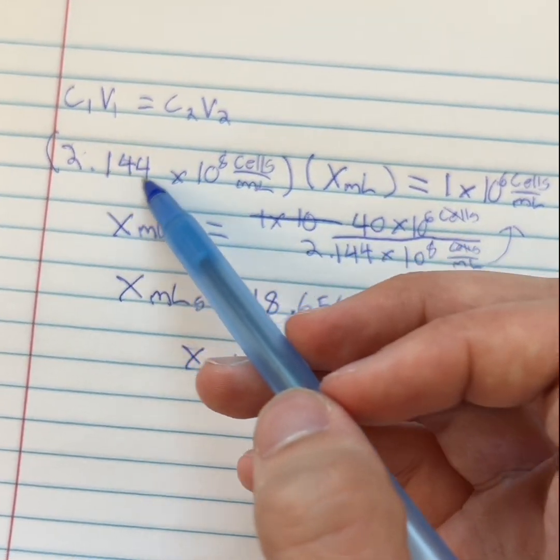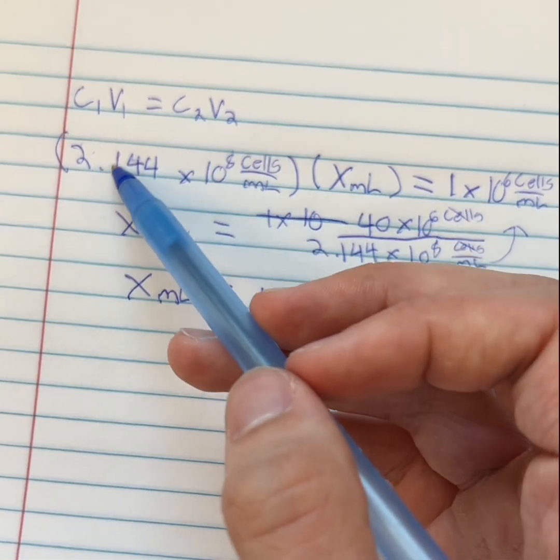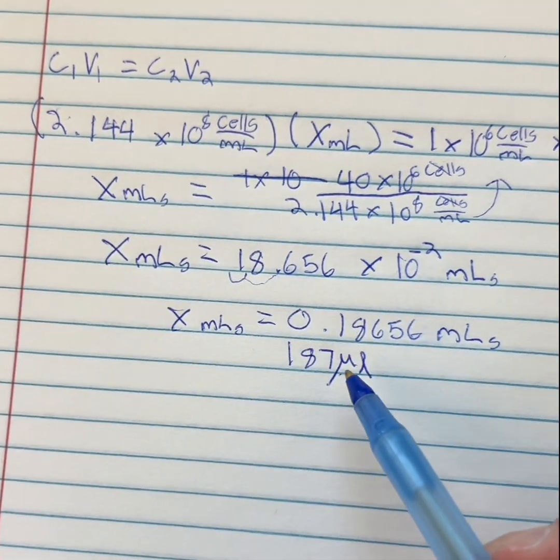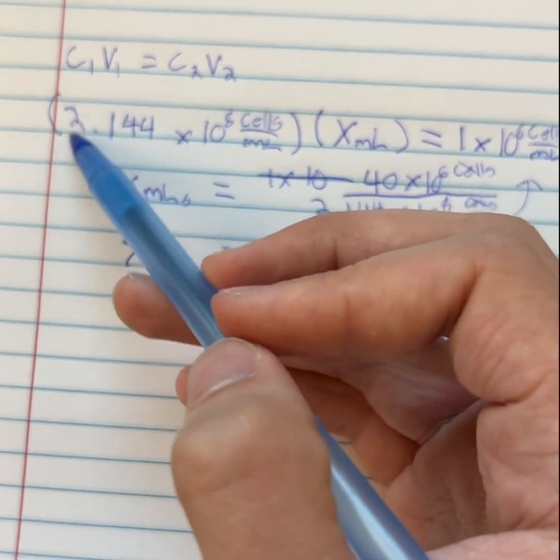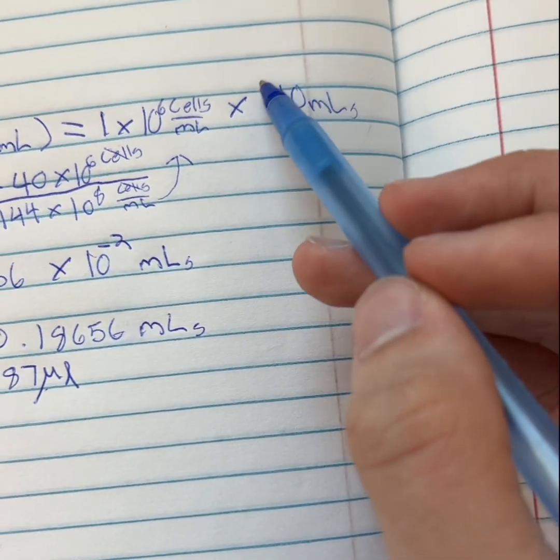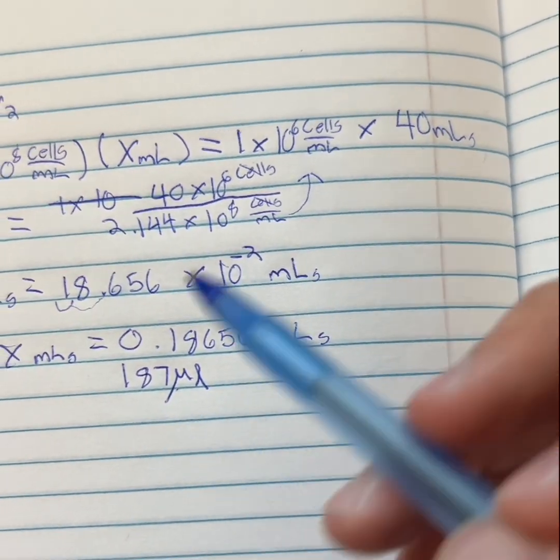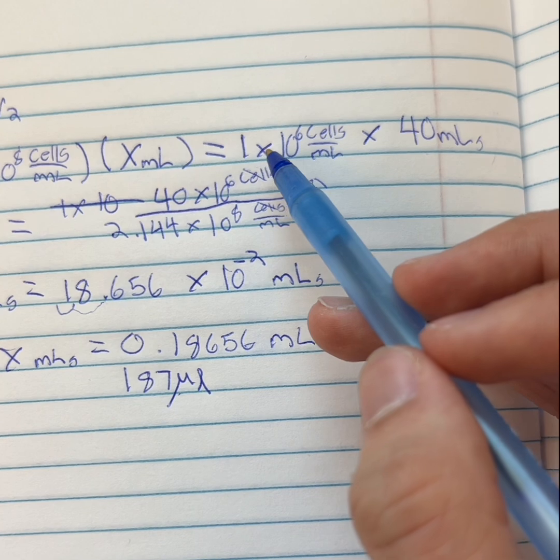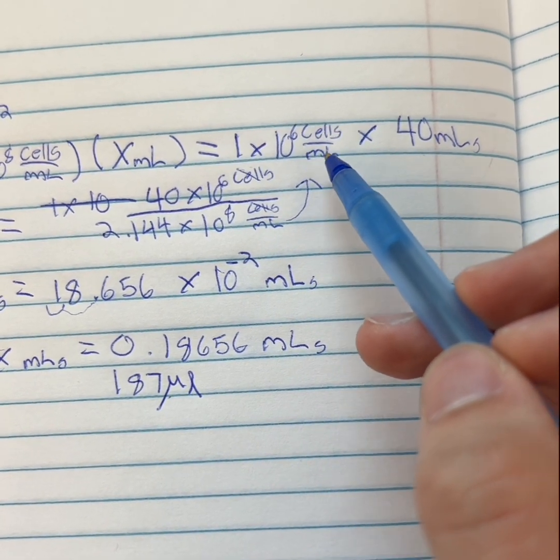So in other words, we're going to add 187 microliters of our original cell suspension. This is what we washed twice and then resuspended in a kind of arbitrary amount of RPMI. So 187 microliters of this goes into 40 milliliters of RPMI to get 40 milliliters of RPMI at 1 times 10 to the 6th cells per milliliter.